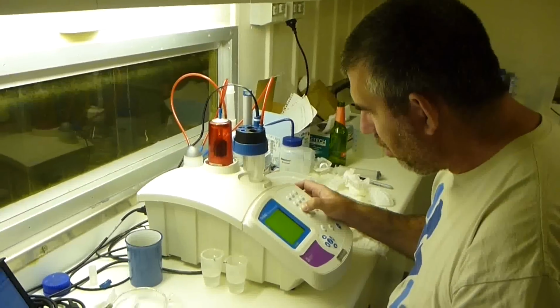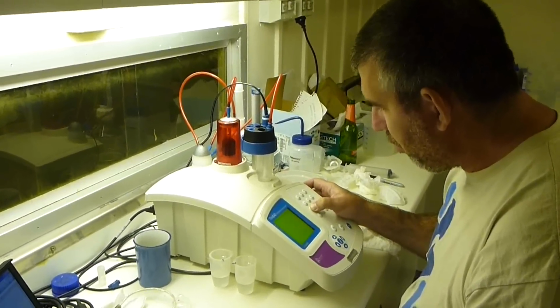So you're supposed to weigh out a certain amount? Yeah, 21 grams.